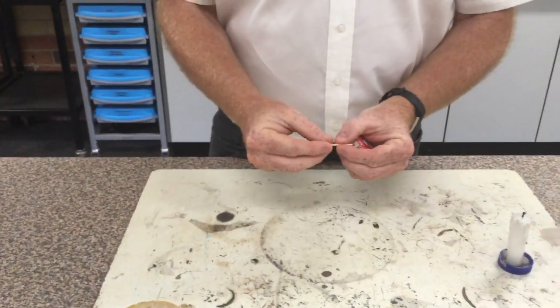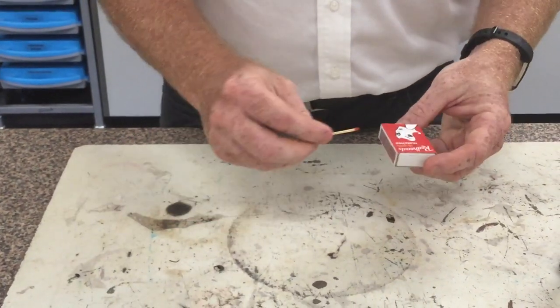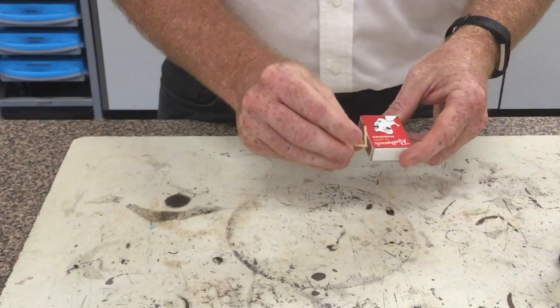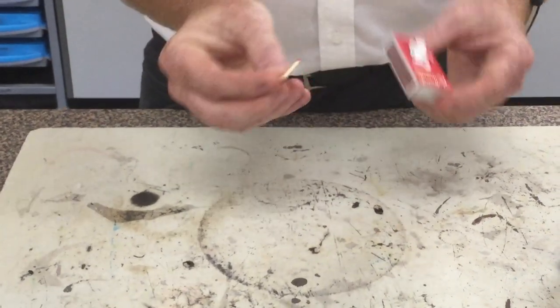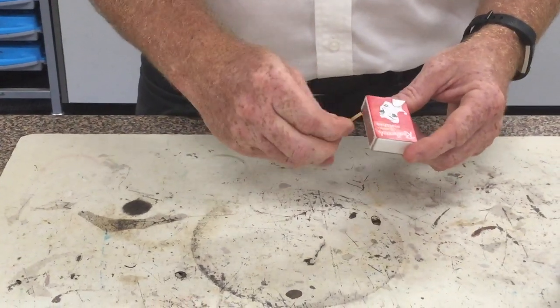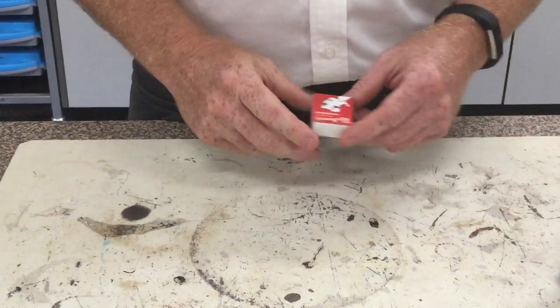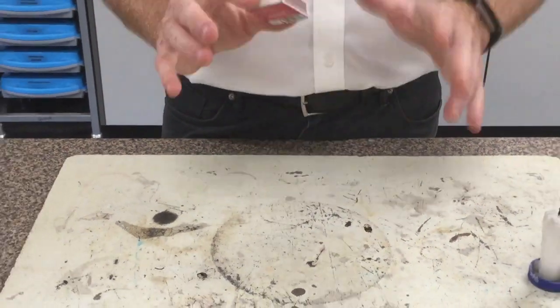Some of you have done it before, some of you have been doing it incorrectly all your life, some of you have never done it — so let's have a look. Let me show you an incorrect way to do it. What lots of people do is hold the end of the match and then flick it. Now that can work, but it can also break the match, and if it lights you've got a bent burning match right up against your thumb — or it can even light, break, and go flying off towards the person opposite you. That's not cool.